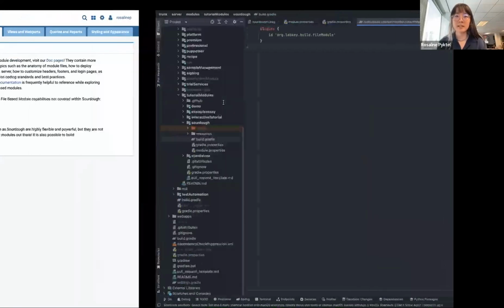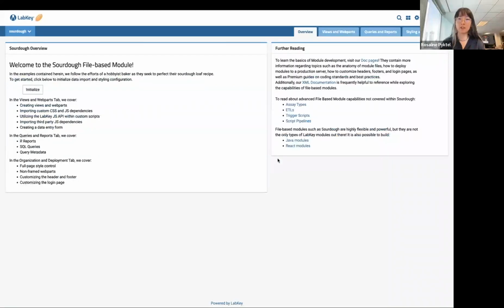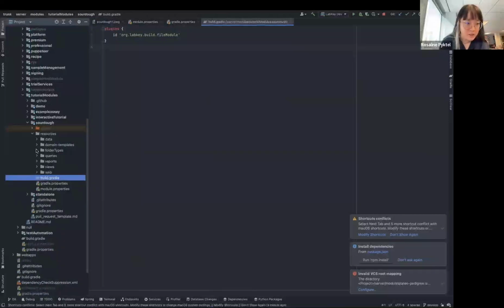One thing that's obvious is that our empty project did not have any upper tabs. And also, we selected the sourdough radio folder type option when making this project. These are both controlled by the contents within this folder type directory.